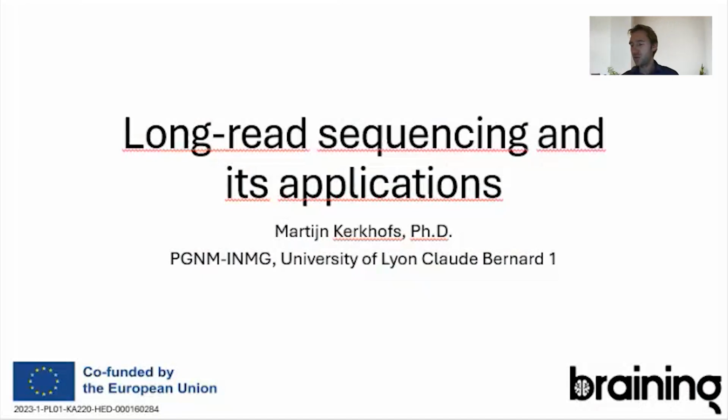Today I opted to go a bit more in detail for the technique of the sequencing, so it will be less heavy on the neurodevelopment and a bit more towards the technical aspect. But I hope that at the end of the seminar you will be able to understand which questions can be answered, and the variety of questions that can be answered when we use the sequencing techniques that I will be talking about today.